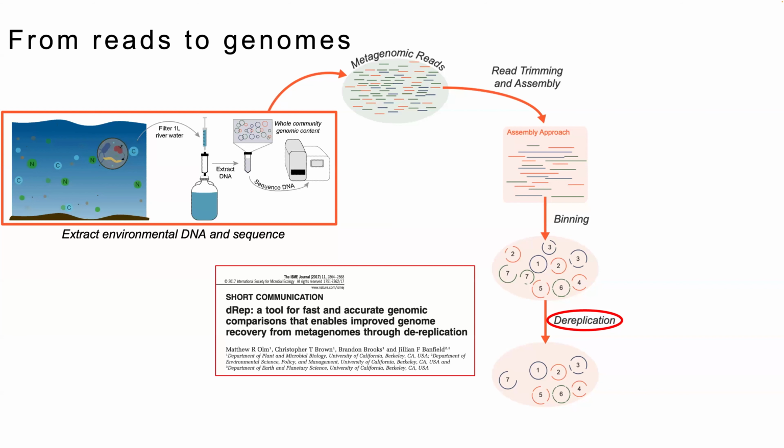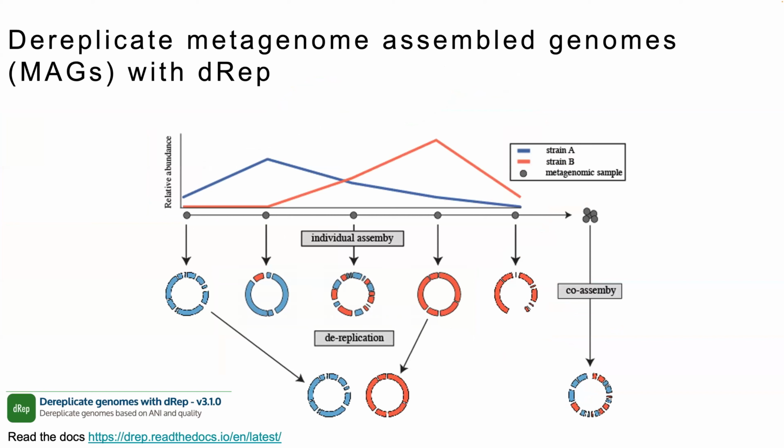Okay, so if we start with derep, or dereplication of genomes, here we're talking about the MAG level. So we have a bunch of MAGs. Each of you had a sample. We had 8 different samples. You all assembled and binned those samples. And so you can imagine that because they are all from the same system or same river, you might sample the same genome more than once.